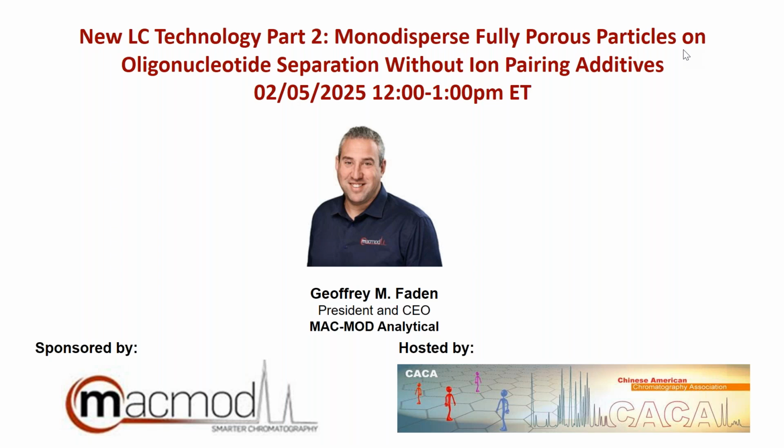So this is the second part of the webinar series. In the first part, now available on recording, it covered the fundamentals of how column efficiency can be significantly improved by the monodisperse fully porous particle technique. So today he will continue the topic on the application side, on how the new column can be applied to oligonucleotide separations.